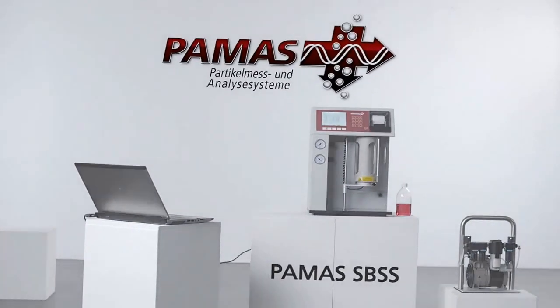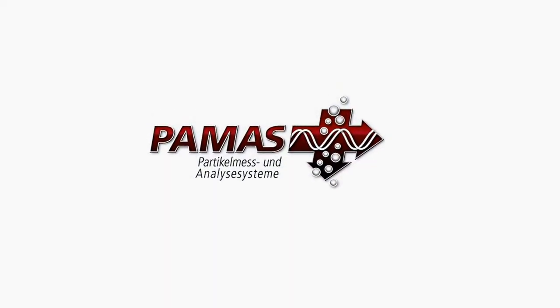The PAMAS SBSS. The fast, accurate, reliable, user-friendly particle counter.